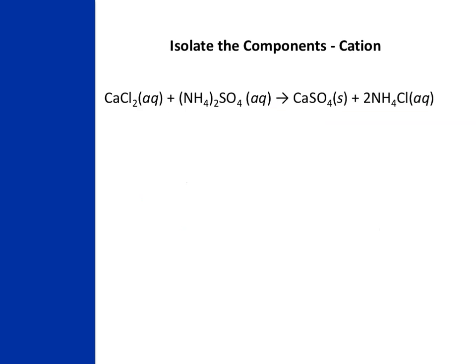This leaves us with determining how much cation is present in the sample. If we follow through our previous reactions, we've released carbon dioxide gas into the air, and our sample is left with the calcium containing calcium chloride and the water. We can further react our solution with another substance, ammonium sulfate, to form solid calcium sulfate in basic conditions. This means the pH of the solution must be between 7 and 14 pH units.